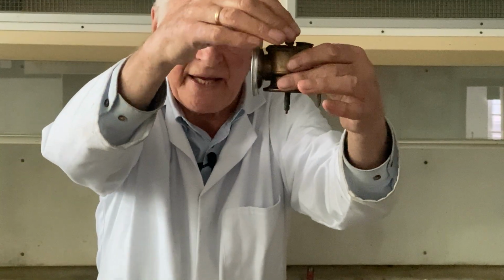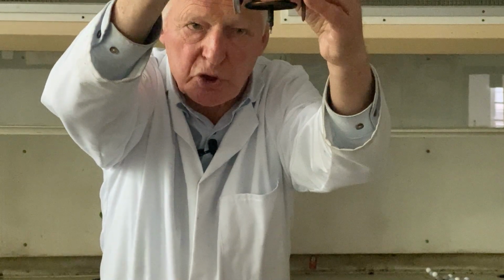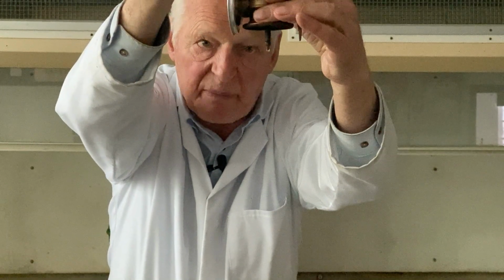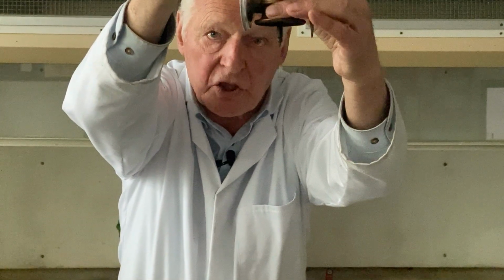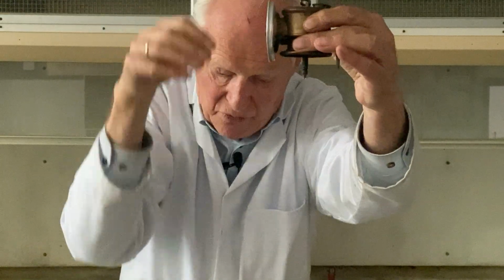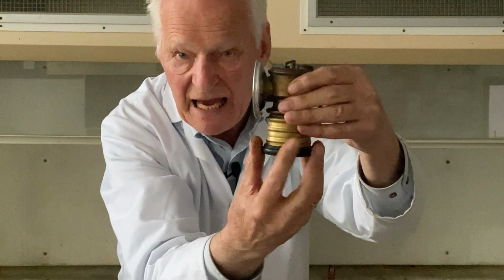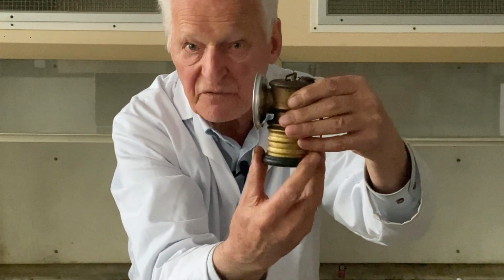There is then a small water reservoir here, and if we turn the tap, you'll be able to see water dripping. There you see, that's water dripping, and that can be very carefully controlled to give just the right level of water dripping. I've now closed it off, and as the water drips, so we have a carefully controlled stream of acetylene.